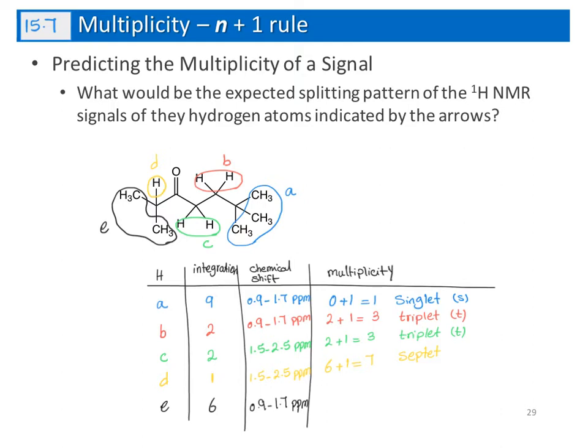And for the black hydrogens, again, we need to define the multiplicity for one of these hydrogens, and that can be true for all the 6 hydrogens. So this hydrogen is connected to the carbon, and then we need to move forward to the neighboring carbon. To the neighboring carbon, we have 1 hydrogen attached. Therefore, the multiplicity here should be 1 plus 1. It's a doublet here.